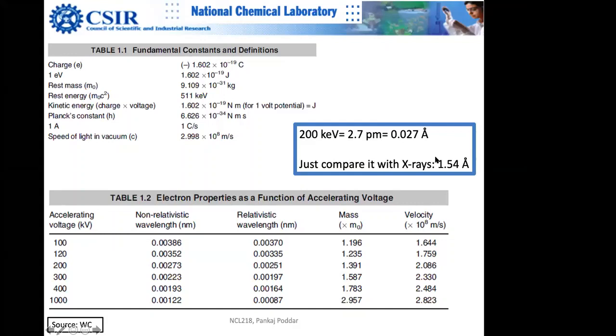And the second question I would like to give you, a very thought-provoking one: how will microscopes look by the time you guys retire? Just think about that. Already the microscopy and spectroscopy fields have merged. You already know that spectroscopy and microscopy are two giant pillars, but they are all merged. You do spectroscopy inside the microscope and microscopy inside the spectroscope.